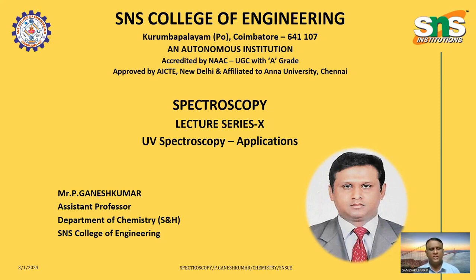And we discussed instrumentation: light source, monochromators, dispersing materials, and cuvettes, that is sample containers, detectors, amplifiers, recorders, etc.